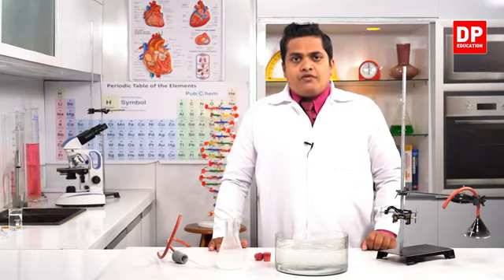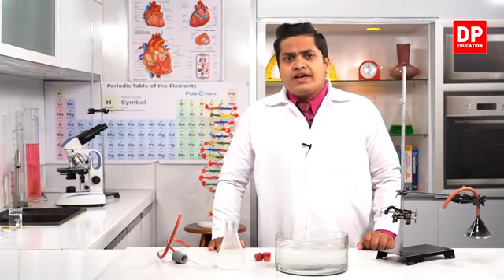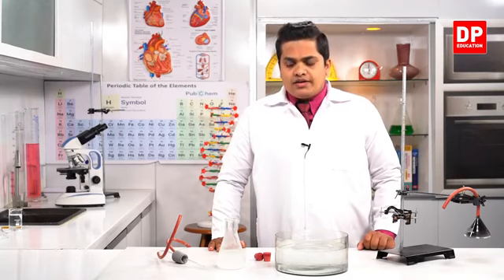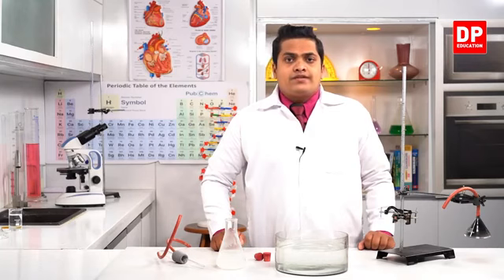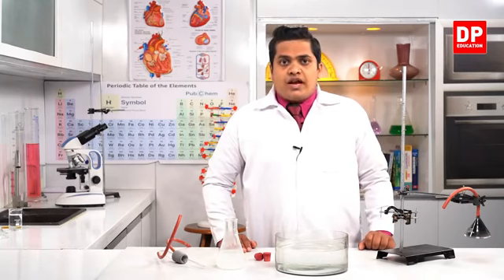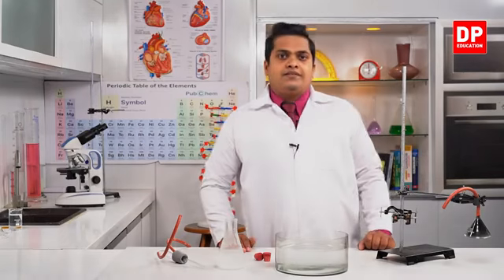So this activity finally concludes that during the burning of fuel, or else during the burning of candle wax, the main products which are getting created are number 1, water vapor, and number 2, carbon dioxide gas. So let's head on to the classroom and we'll write down our observations and conclusions from the activity.